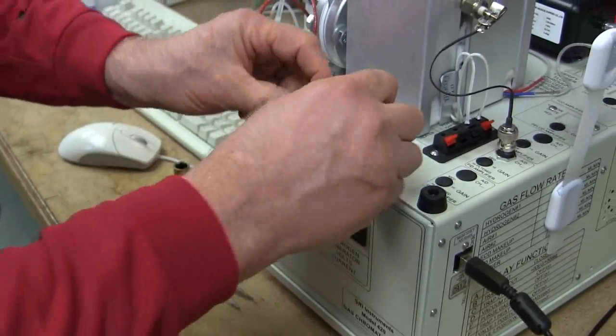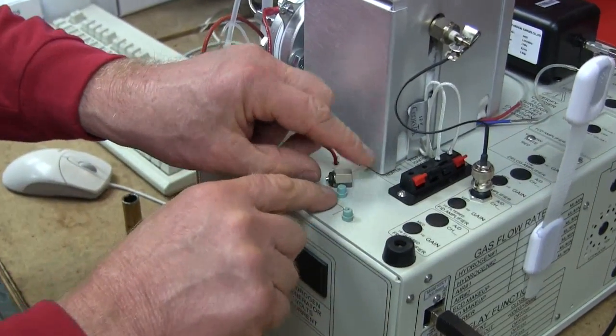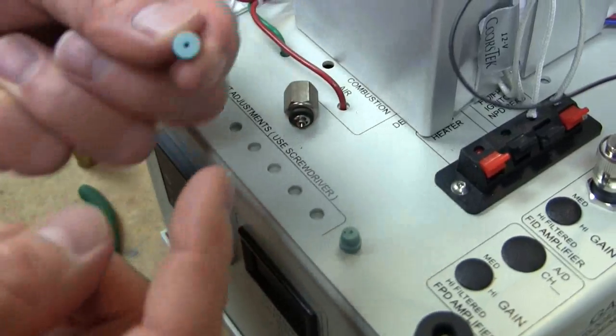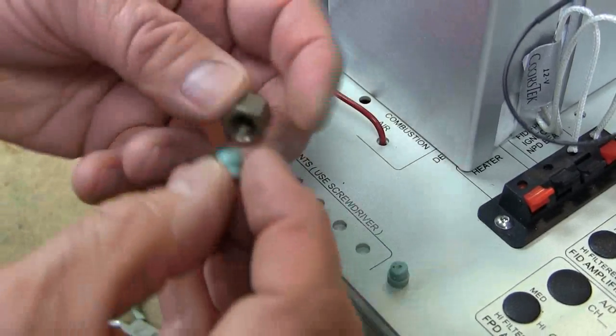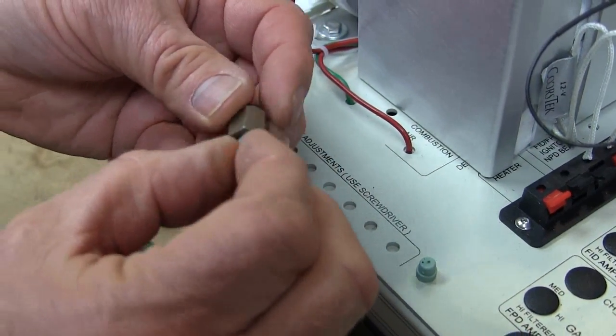And then you put the new septum in. Now notice that the septum has kind of a narrow side and it has a fat side. So the fat side goes into the nut like this.